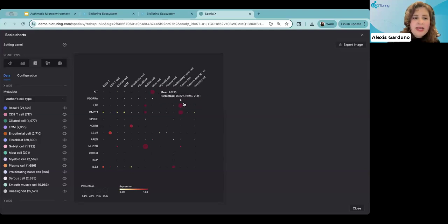So again, this is data that you're able to access. And when you hover within the actual node region for that specific cell type cluster within that gene, it gives you a bit more information on the mean expression within that group and the percentage of cells, so this percentage of serous cells that are actually expressing this target within just severe asthma because we've subclustered only those samples. So again, these are different questions that you can try to answer to really look at these differences.